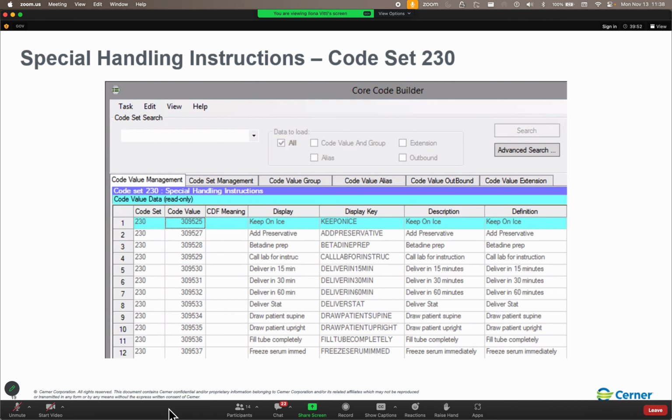Now, what would happen is that this is what the barcode would have: 2, 3, 4, and then 2, 3, 3, 1, 7, 0, 0, 0, 6. So when the label was scanned, maybe going into accession result entry or specimen login, if there was another accession that had the 2, 3, 4, the 3, 1, 2, 3, 3, 1, 7, 0, 0, 6, you would actually have a pop-up window where you would have to select, hey, which one of these are you logging in?